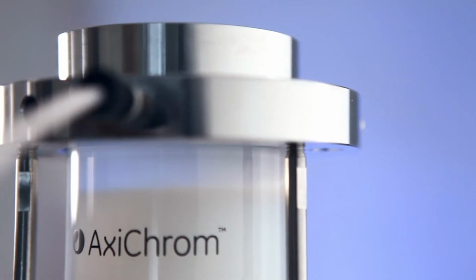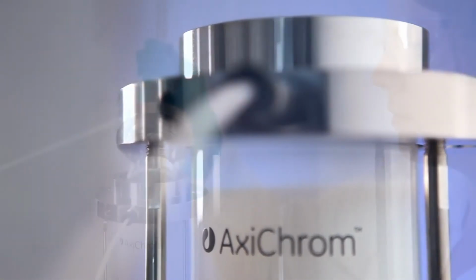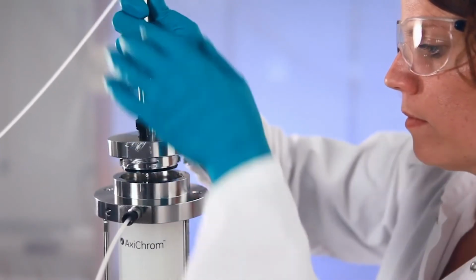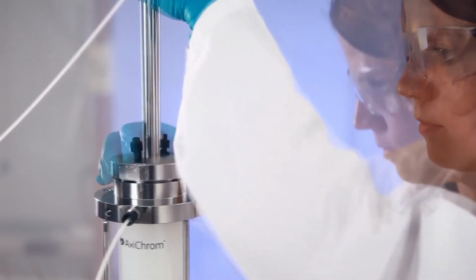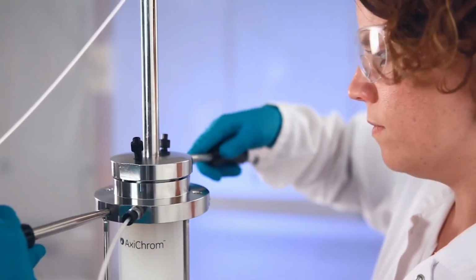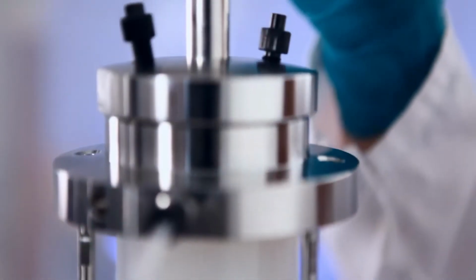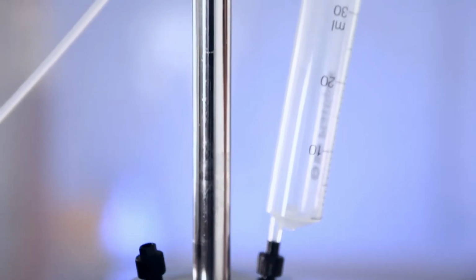Let the medium begin to settle so that a clear zone appears at the top. Place the adapter into the column at an angle to avoid trapping air under the bed support. The lid is easily closed using the bayonet fittings. Place a syringe on the vent valve to collect liquid when purging air from the hydraulic chamber.